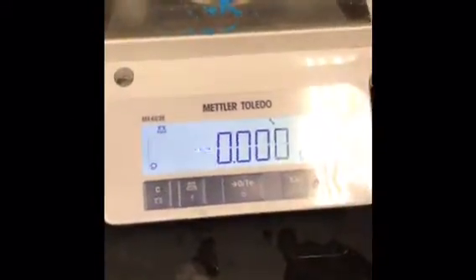So now we're going to take the mass of this. First, we zero our balance, and then we put the solution here. With this concentration, it was 44.558. Okay, we'll subtract 19.636, which is the mass of the concentration flask. That would be 24.9. Okay, so it's lower.